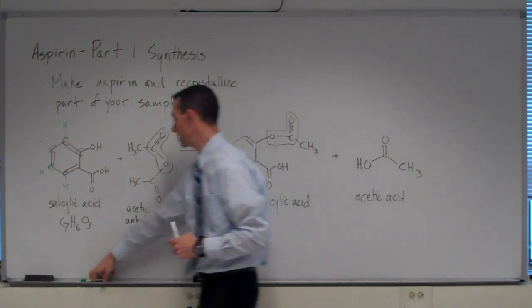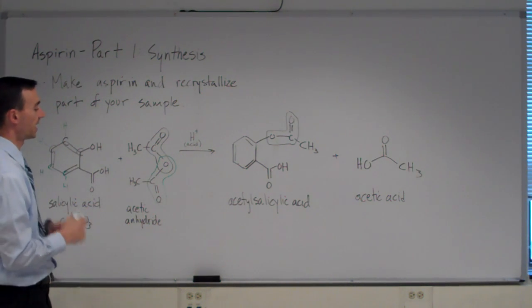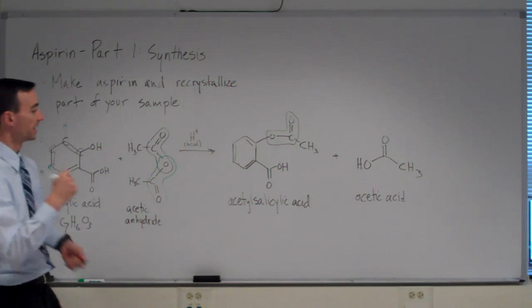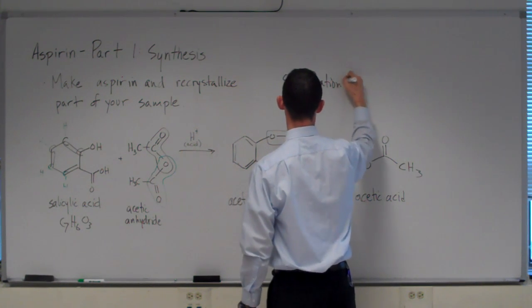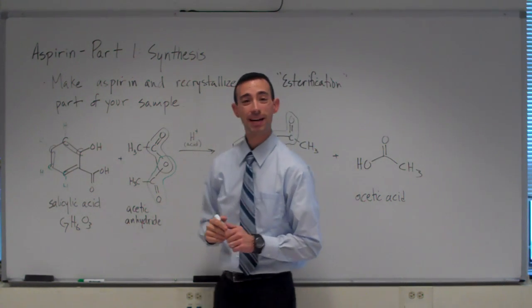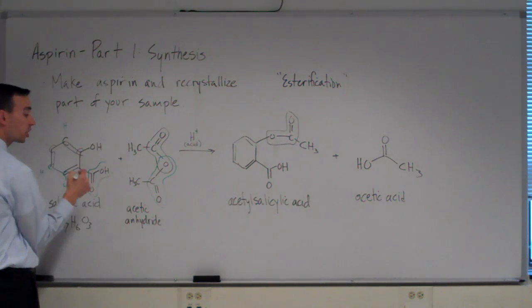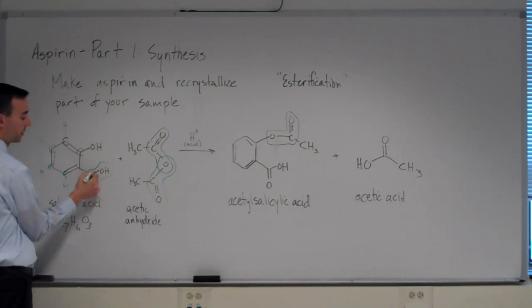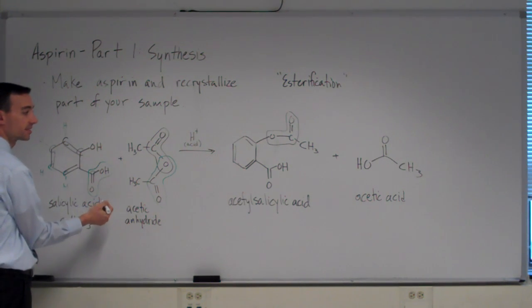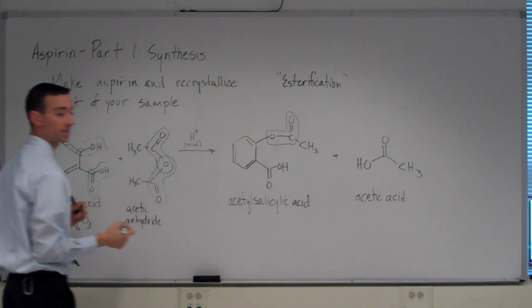That's one. This compound would actually be a double ester. It has 2 esters there, the acetic anhydride. And the process of making aspirin is what's called an esterification reaction. In it, we react a carboxylic acid, and a carboxylic acid is another functional group. It terminates a molecule, so it has carbon double bonded to oxygen and then an OH group attached to it, and then it would go off to some other component of the molecule. So we react a carboxylic acid, turning it into an ester. Although here we're actually turning the OH into the ester in this case.